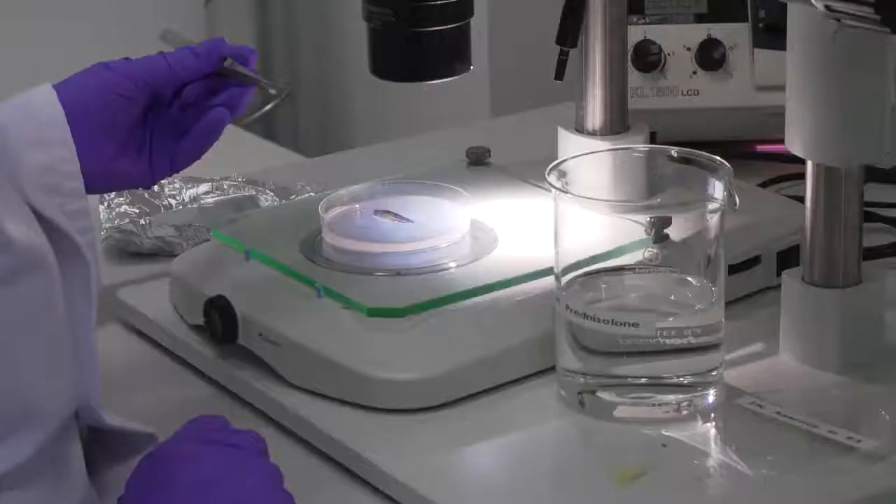It is important to introduce not too many fractures into the fin, because this might greatly impair stability. Then transfer the fish into an autoclaved beaker containing 300ml of fish water.